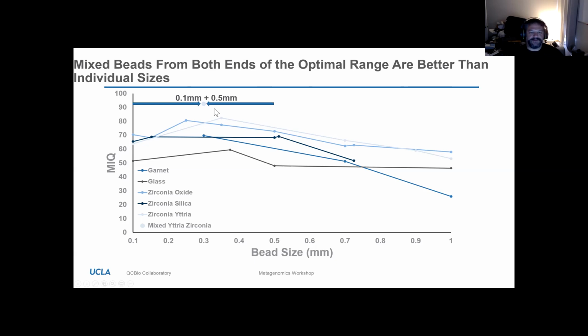Okay. So one of the points of this is beads definitely generate good even lysis. And one of the other lessons I got from this is you really want to have lysis that approaches about 100% of the microbes in a sample, because otherwise, due to the biophysical differences of the microbes, that inefficiency of less than 100% lysis is not spread evenly.